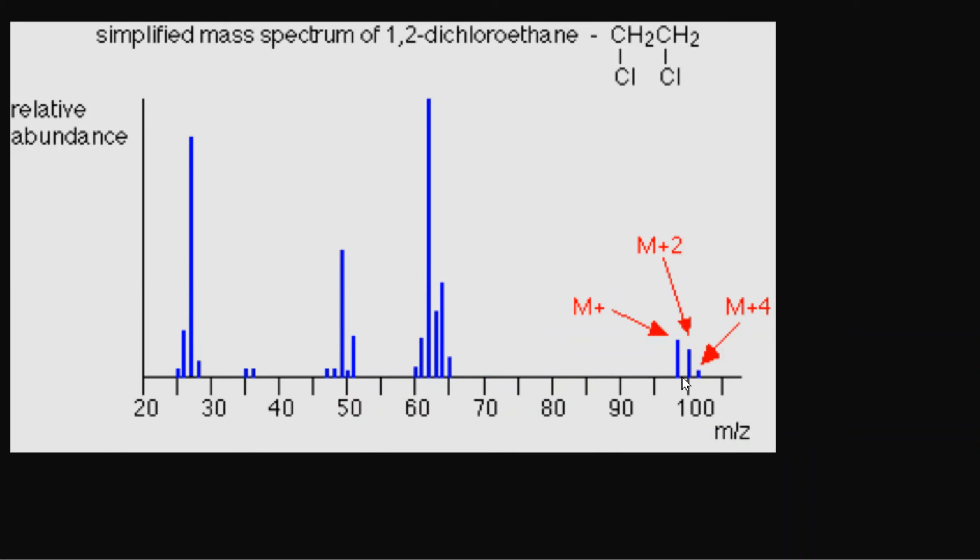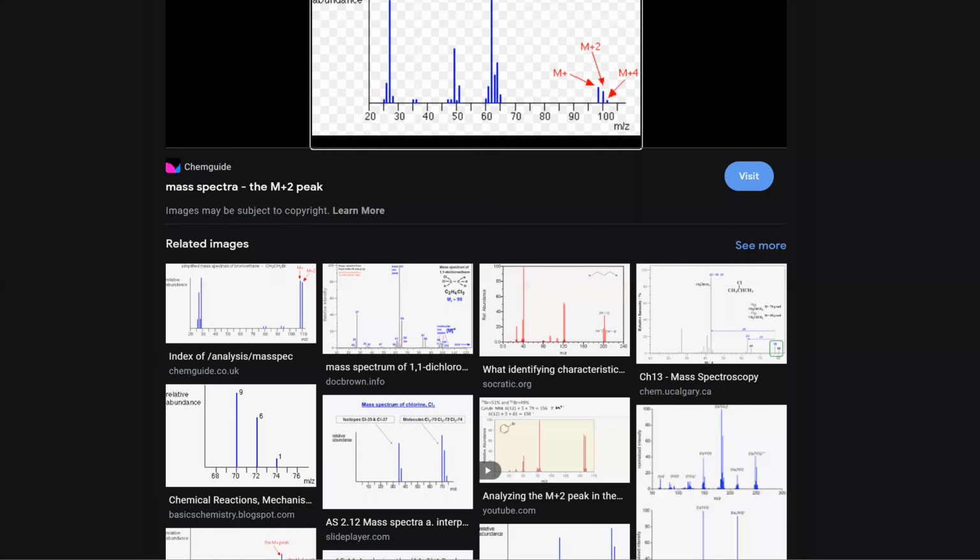You're going to detect something at 9. These are your molecular ion peaks. The molecular ion peaks are kind of unique. They're much further away from the fragments. And by just looking at it, you can tell that it's 9:6:1. Is that clear? Okay, so even if you're not given the molecule, you will immediately know that it's got 2 Cl's.